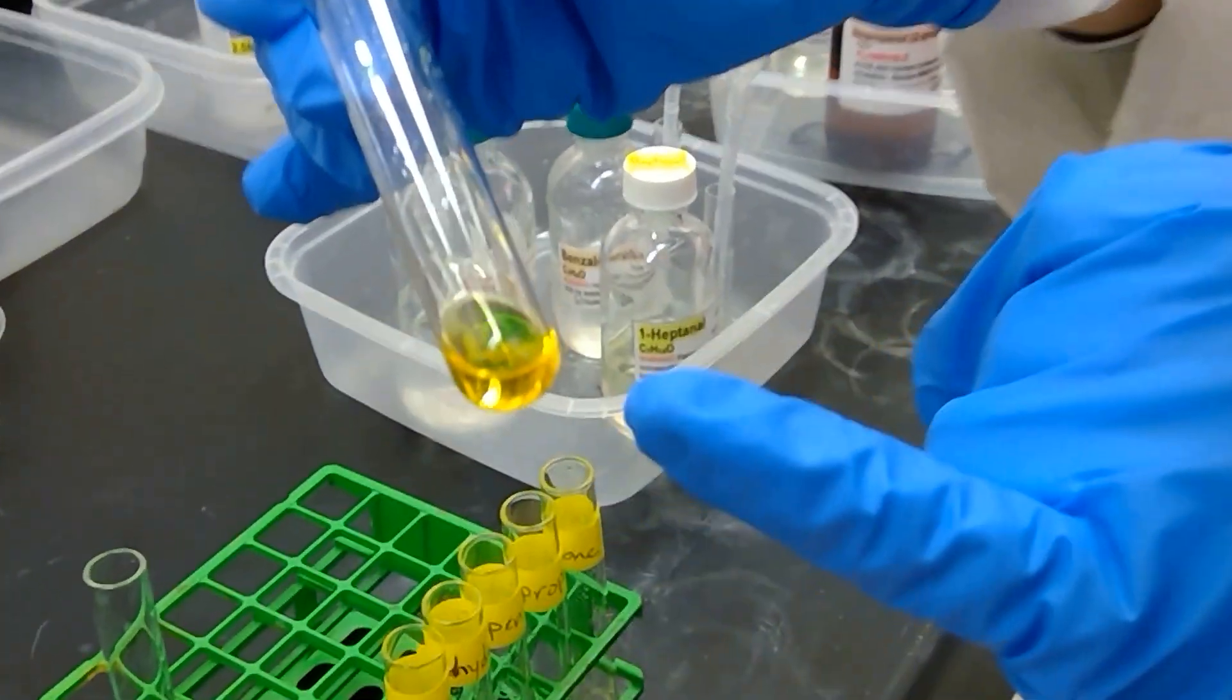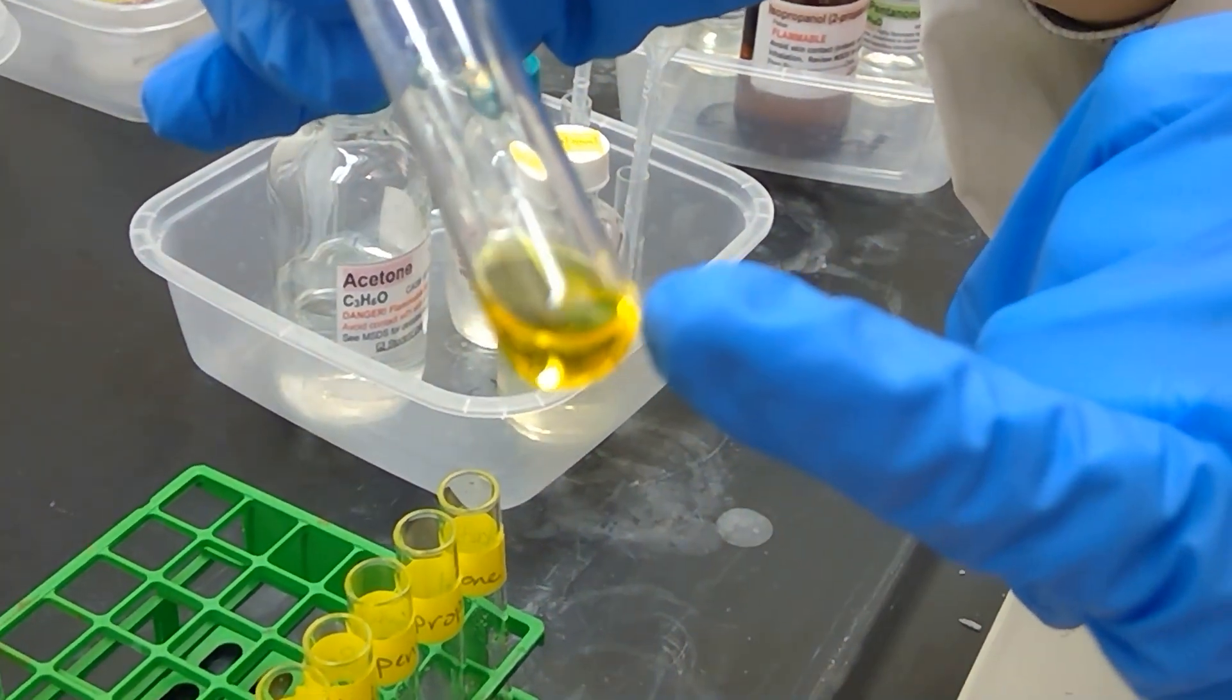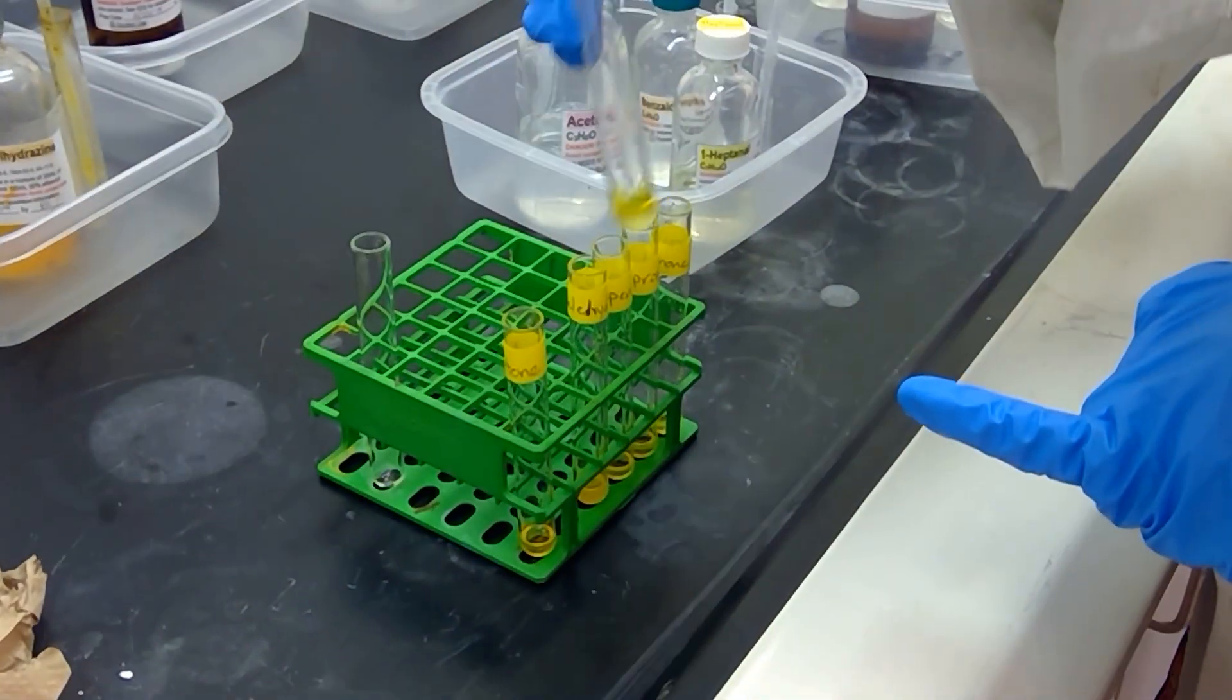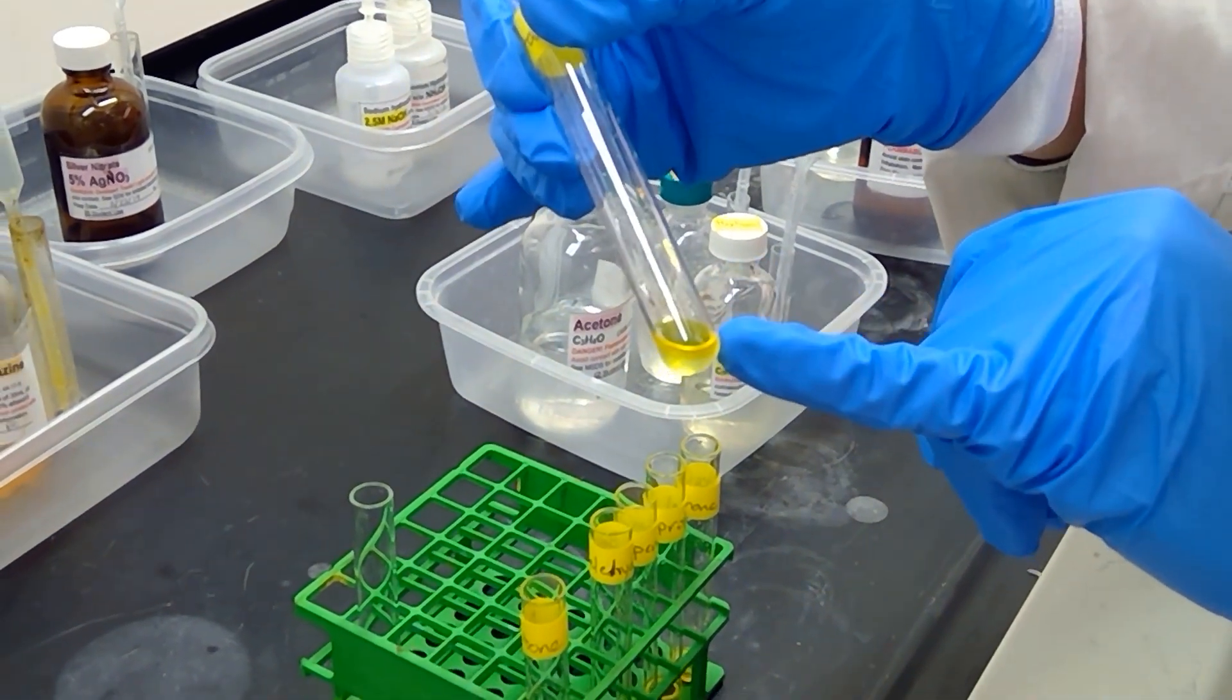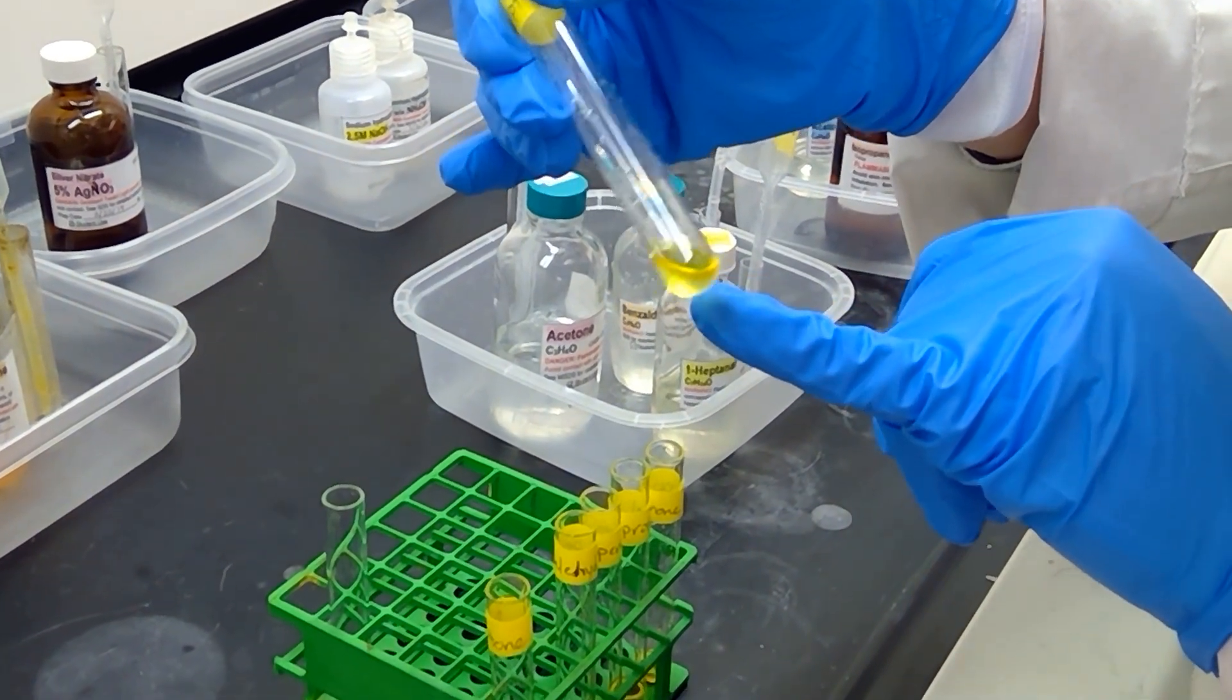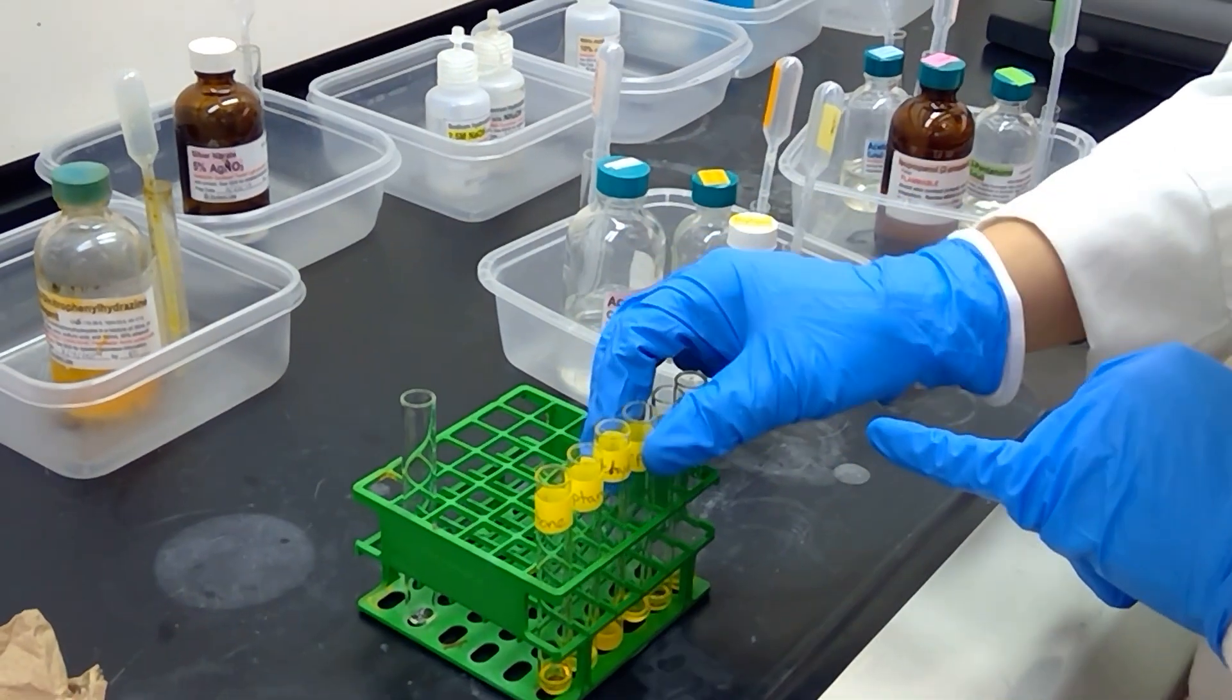Our acetone sample is also showing some more of that orangey-red precipitate at the bottom of the test tube. Let's take a quick look at heptanol. Heptanol looks kind of like a two-layer system, like a viscous, oily substance towards the top. Let's take a look at our next three samples.